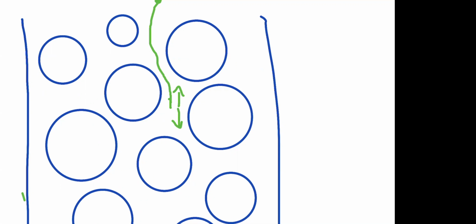So we can see that some of the molecules may get in front of the mobile phase and some may get a bit behind, simply due to the fact that they diffuse either in the mobile phase flow direction, but some of them diffuse in the forward direction while some diffuse in the backward direction.